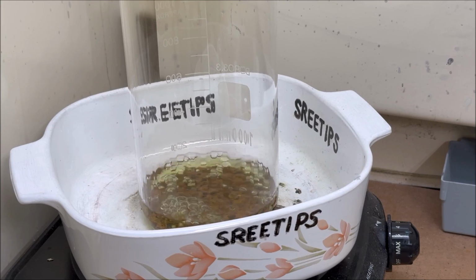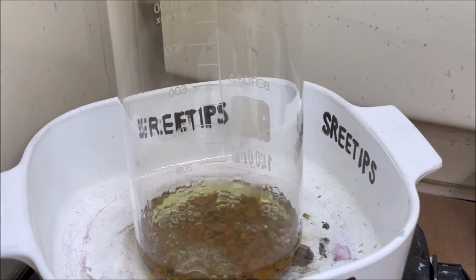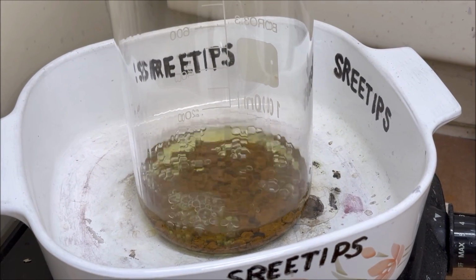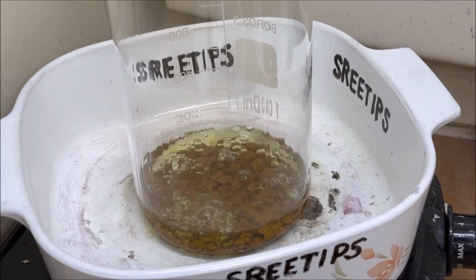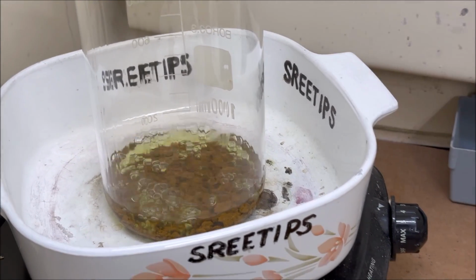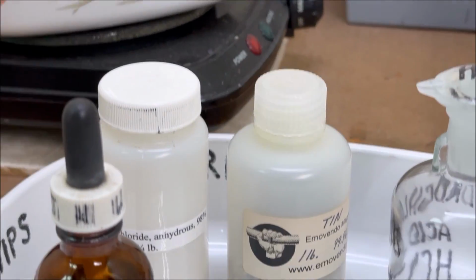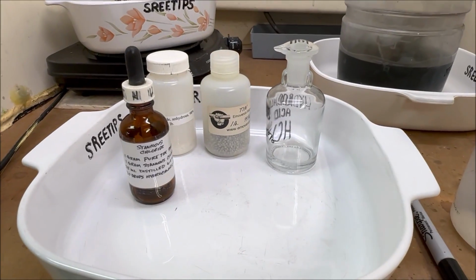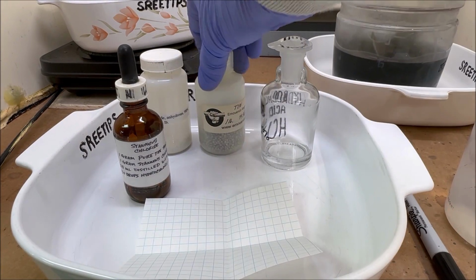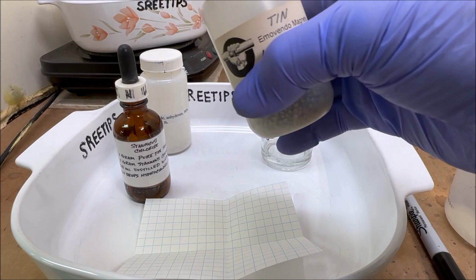Sreetips here, and I've got some gold back here boiling in nitric acid, and you can see it's turned a little bit of a yellow color. What we're going to do is I wanted to test that stuff with some stannous chloride, but my stannous chloride is out of date. So we're going to make some fresh here.